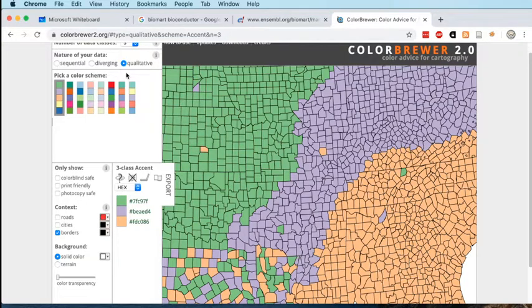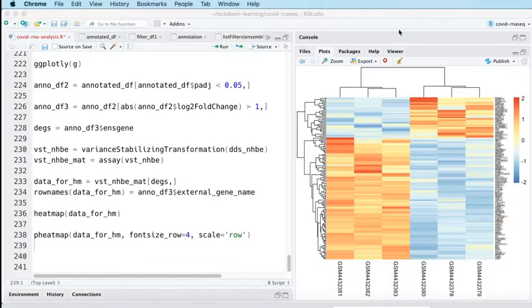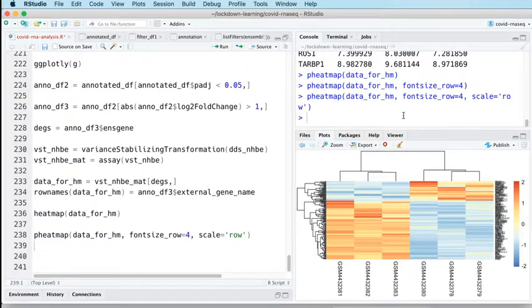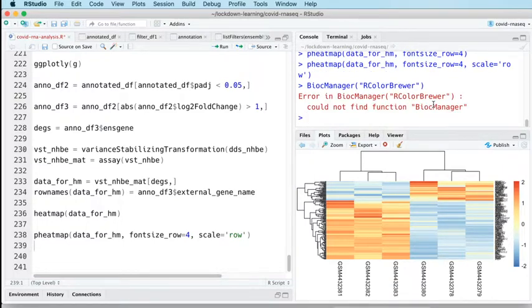And they are available in R in a package, as so many other things are. So in R, we are going to install another package. This one is called RColorBrewer. Colors spelt the American way with no U, and the R, the C, and the B of RColorBrewer are all capitalized.